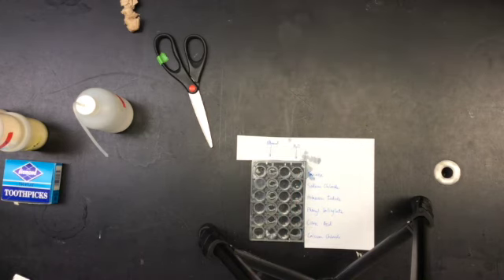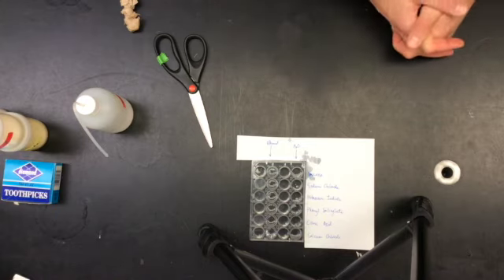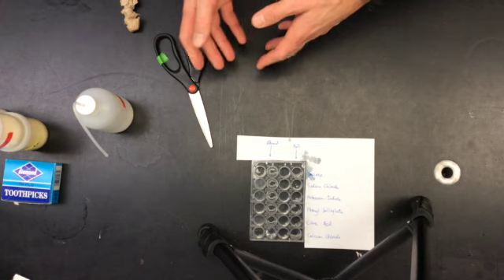All right. So in your data table, you should be marking down whether or not the solution conducted electricity. So this is a conducts or does not conduct electricity. And again, when we're looking at solubility, it dissolves or it does not dissolve.